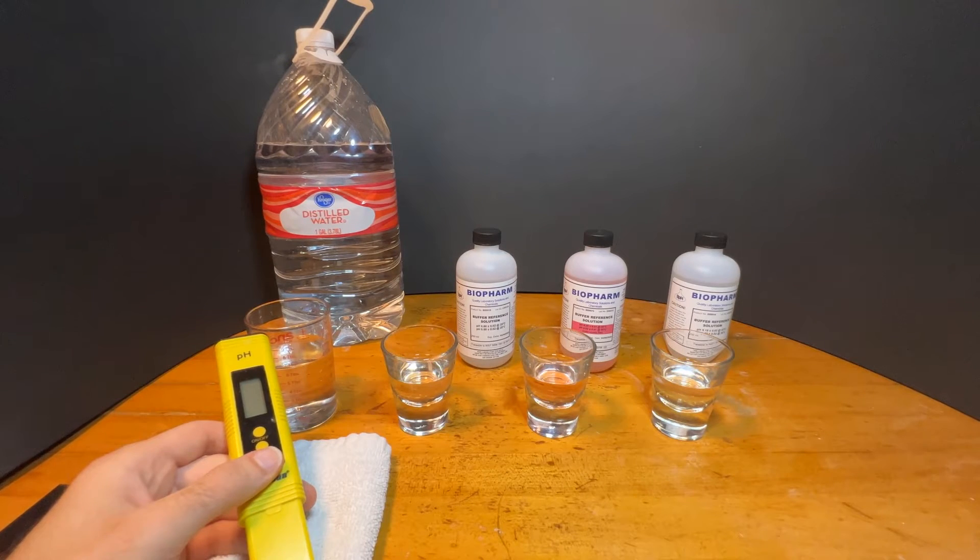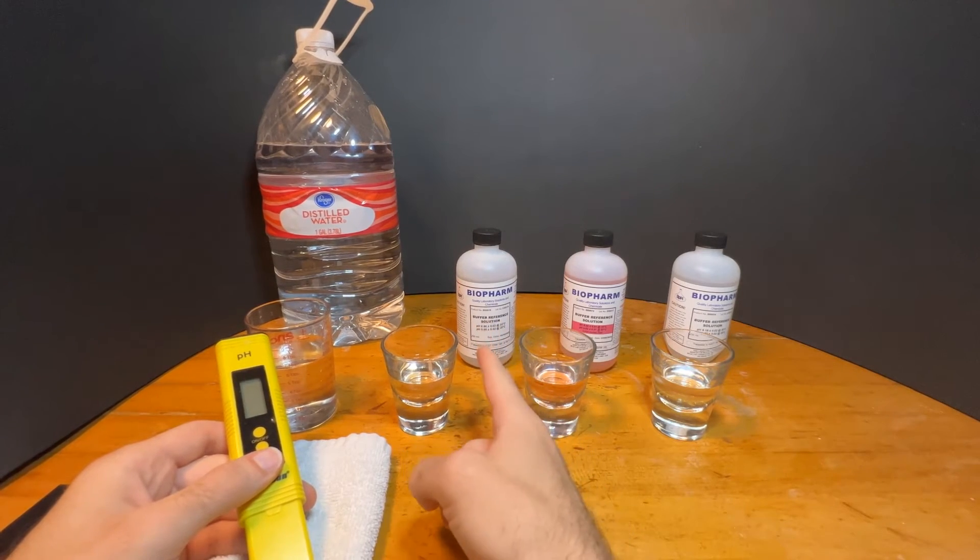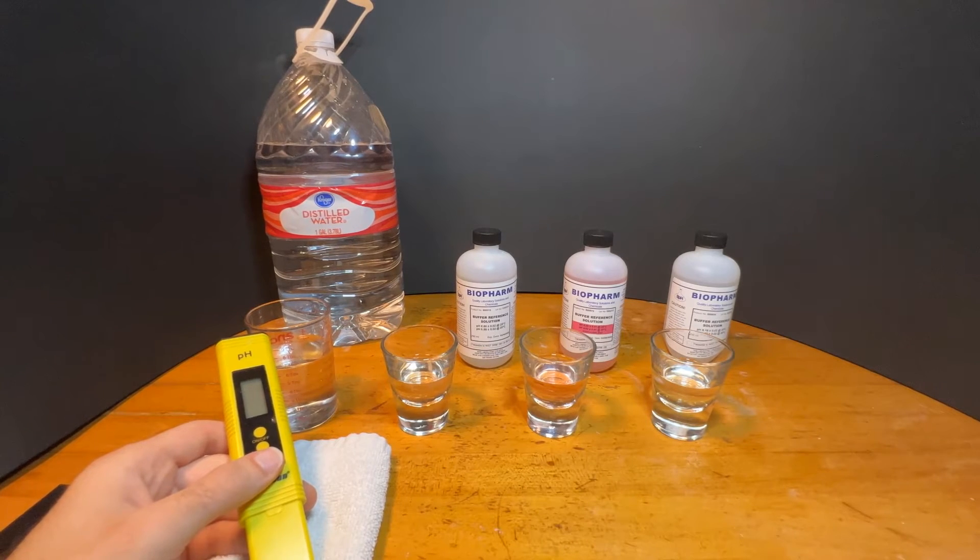The calibration always starts with the 6.86 solution. If you want, you can stop your calibration here. This one-point test will get your meter accurate to plus or minus one-tenth of a point. I've found that while this is accurate enough for my use, I still do the three-point test. The three-point test raises the accuracy to plus or minus one-hundredth of a point and significantly reduces the amount of time it takes the meter to stabilize a final PH.